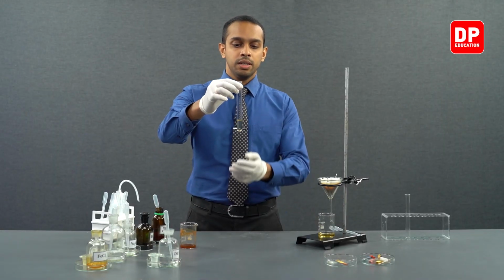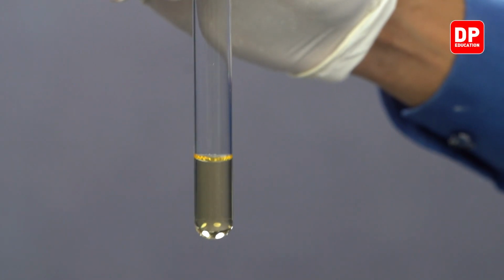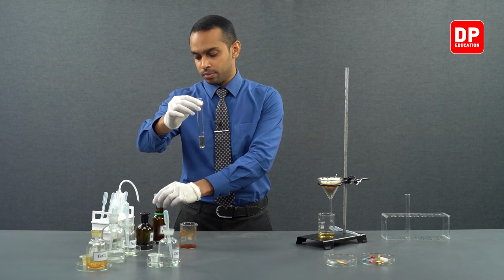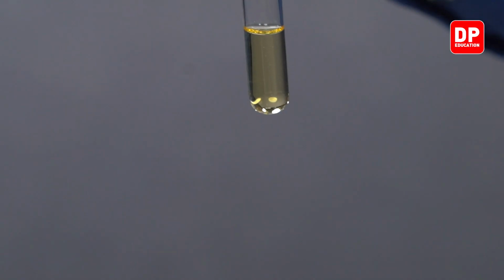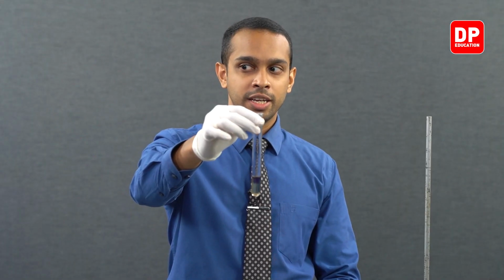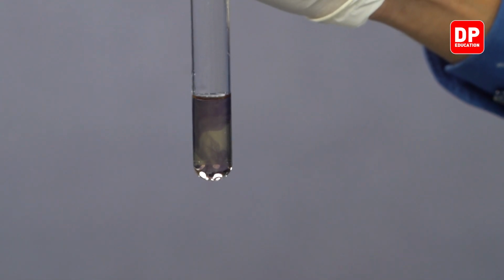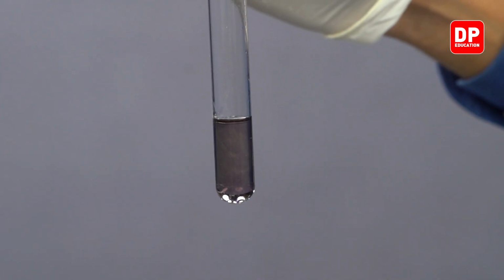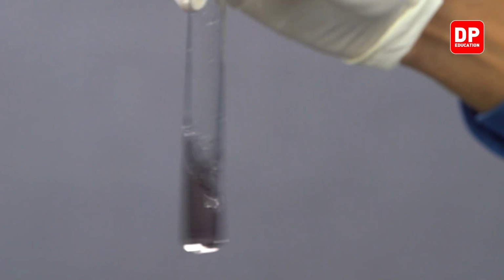Now we have our neutral ferric chloride solution here. To this, let's add a small amount of phenol. Let's add a drop of phenol. As you can see, when we add a small amount of phenol, the color of this solution is starting to change. I have not yet shaken it, but you can see a violet color forming when we add phenol to our ferric chloride solution. Let's mix it to see the color very clearly.